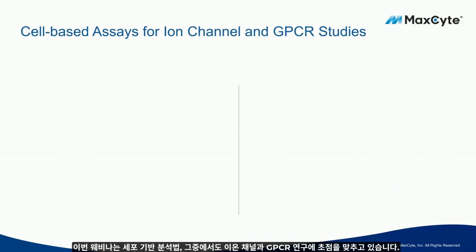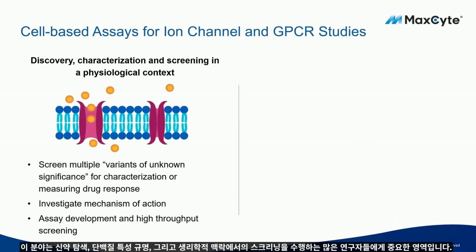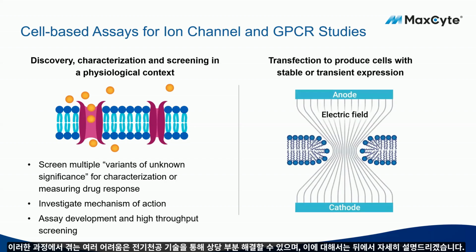This webinar is targeted towards cell-based assays, specifically ion channels and GPCR studies. And so this field is important to many researchers, including you guys, for discovery, characterization, and screening of specific proteins in a physiological context. For example, screening multiple variants of unknown significance to characterize or measure drug response, to investigate mechanism of action, and also to just develop assays to measure these things in a high throughput fashion. And so some of the struggles with these are overcome by electroporation, which I'll go into detail later.